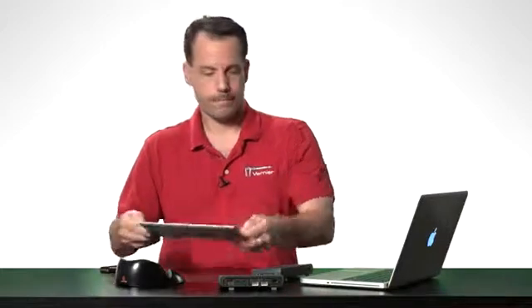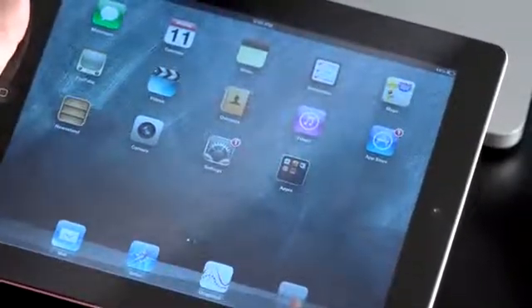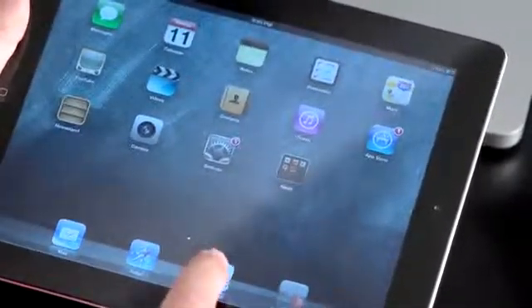My iPad right here is actually connected once again to a network called wireless network, just like my LabQuest2. So to view any data, all I have to have is an app that can actually view that data from my LabQuest2. In the case of the iPad, it's something called Graphical Analysis. Let me show it to you. If you look right here, there's an app called Graphical Analysis. If I tap on that app, you can see right now that there's no data server attached. It's not seeing any data from a LabQuest2.